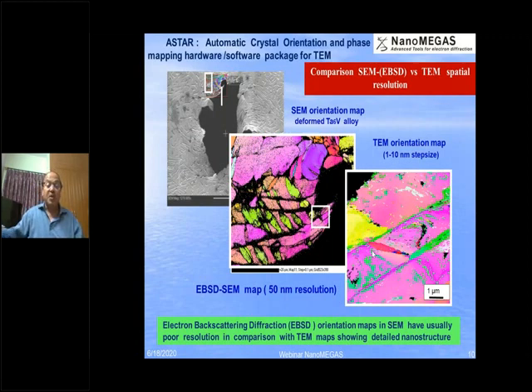That means if you increase the resolution, I will give an example. Suppose you take a lens in your hand, and you draw two different dots under the lens using a pen, and if you remove the lens, what you see is one dot. That means the two dots are merged if you don't have a lens. If you again put the lens, you can see there are two distinct dots on the paper.